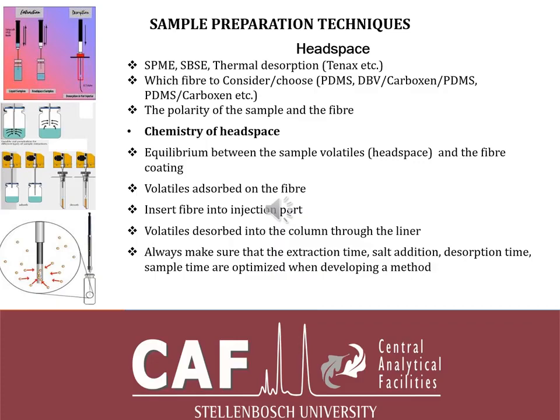And the sample time could also be optimized. Sample time means how much time you take to absorb your compounds from the sample, and also the sample volume. How much volume do you need for that extraction?